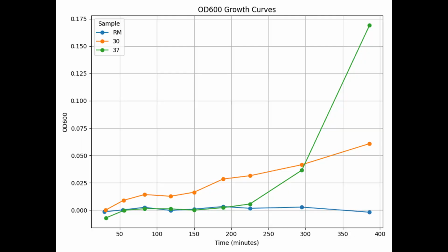So while the room temperature culture was not exposed to air, the blank cuvette was. The fact that the blue line is so flat maybe indicates that we're, I don't know, there's a number of ways to interpret this. Because we get to an exponential, my guess is that the blank actually never got contaminated, but it is something I would do differently.